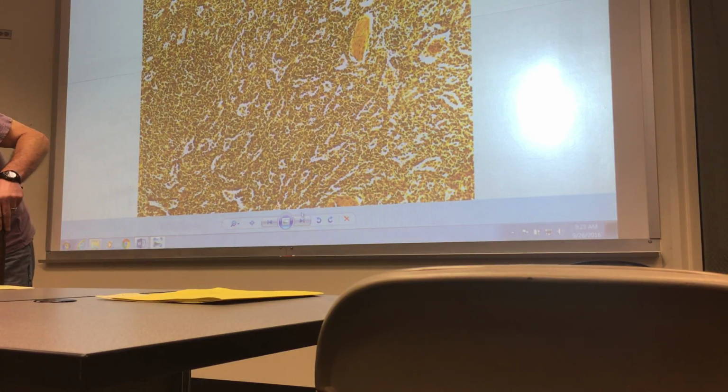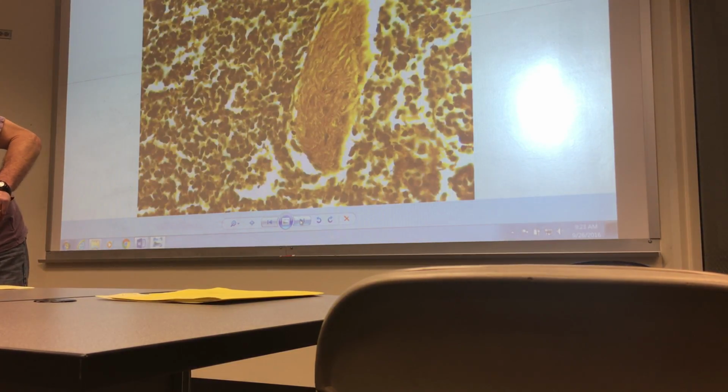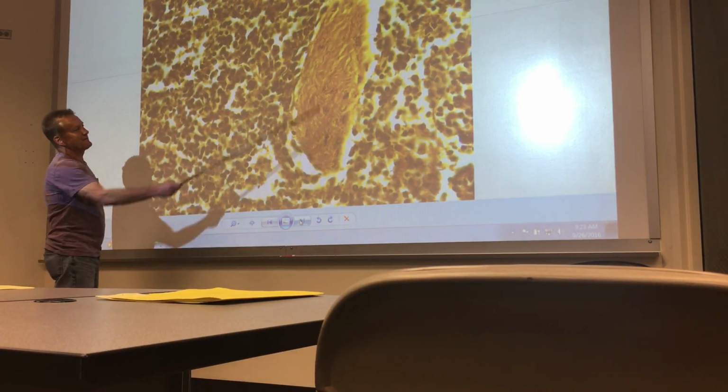This, of course, is reticular connective tissue. It's one that you can always use color to recognize. Several of you, a couple of you each day last week, and I have 4 labs, as you know, asked me what this is, and I told you it's called a venous sinusoid. You don't really have to know anything about it, but it's a little capsule, we could say, in the reticular connective tissue where blood is contained. And the cells that you see in there are primarily red blood cells because, as you know, most of the blood cells are red cells.